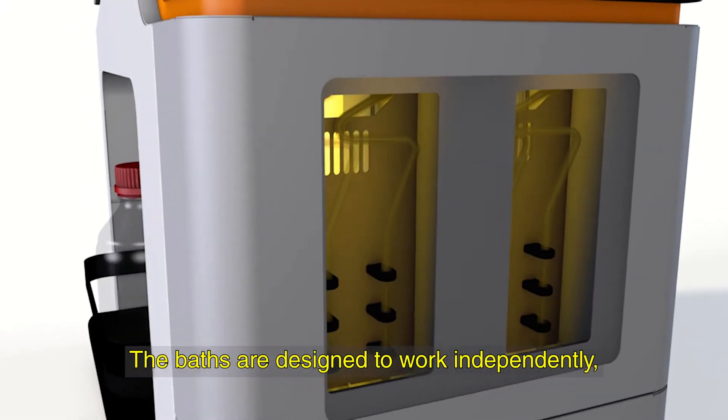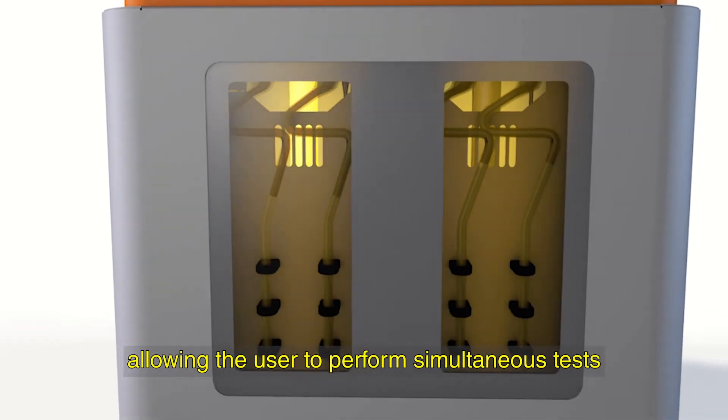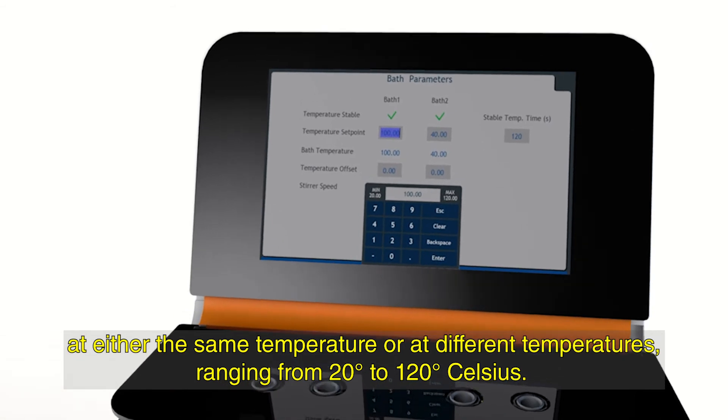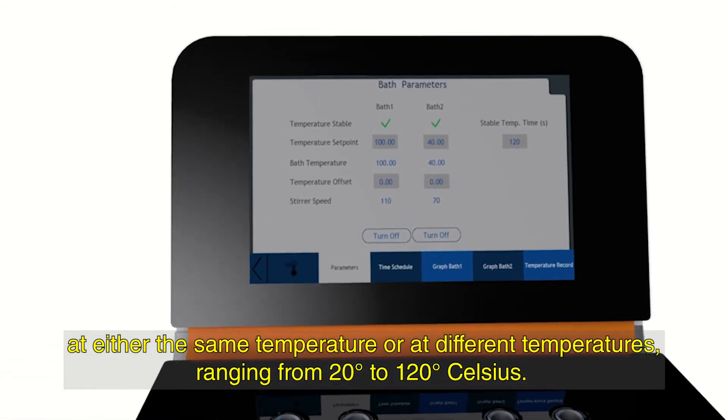The baths are designed to work independently, allowing the user to perform simultaneous tests at either the same temperature or at different temperatures, ranging from 20 to 120 degrees Celsius.